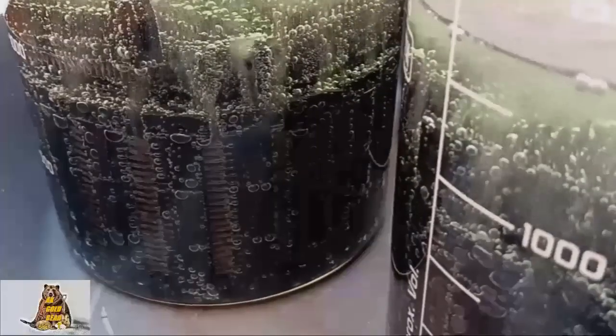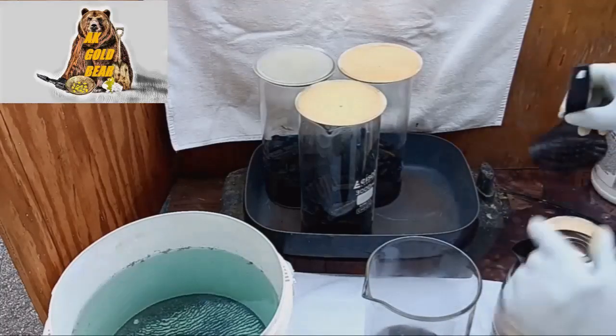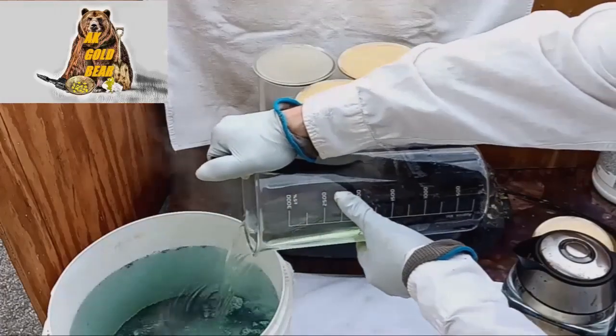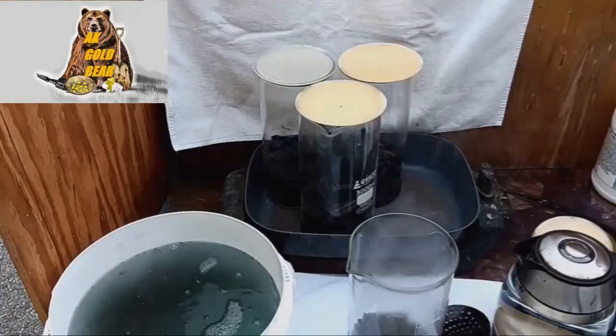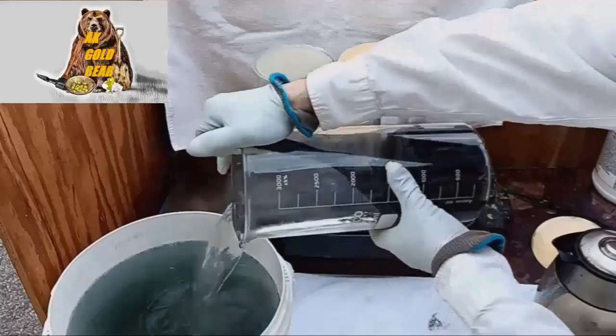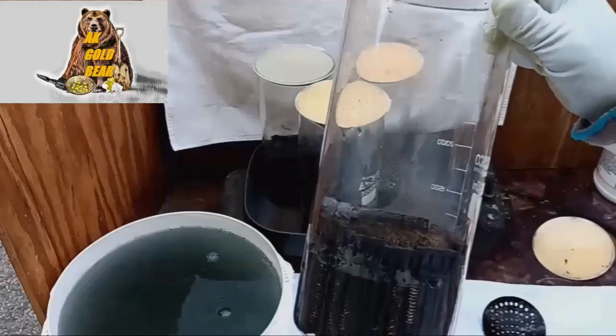After two hours, connectors are clean. Now all the dirt and oils are in solution — solution is dirty. I need to drain the dirty solution and rinse connectors with hot water. Very hot.